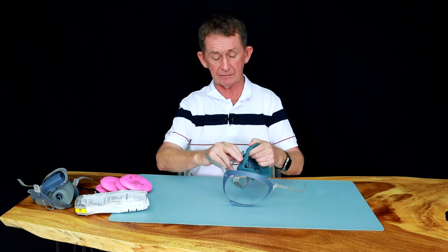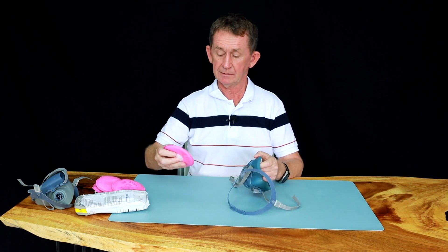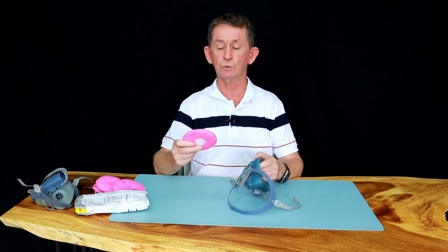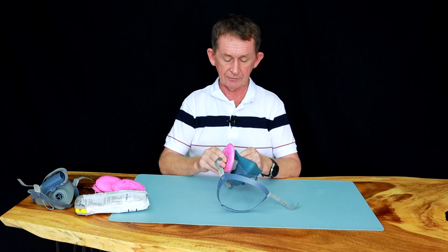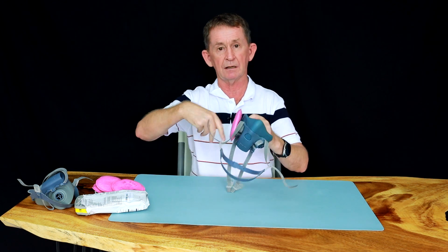For that we use P100s — these are 2091s. They go on as bayonets, and there's no particular orientation because they're round.